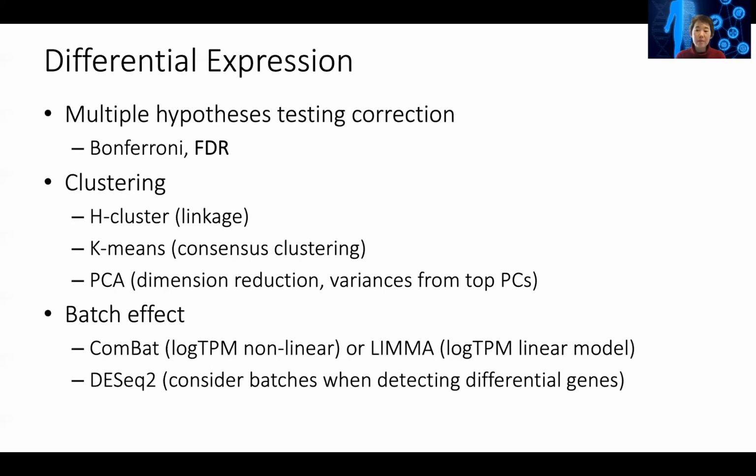So most of the time, if after FDR adjustment you only have, say, 200 genes, you should probably just take all of them. But if after the FDR adjustment you still have, say, 1,500 genes, you could use fold change on top of the FDR to cut the differential genes.